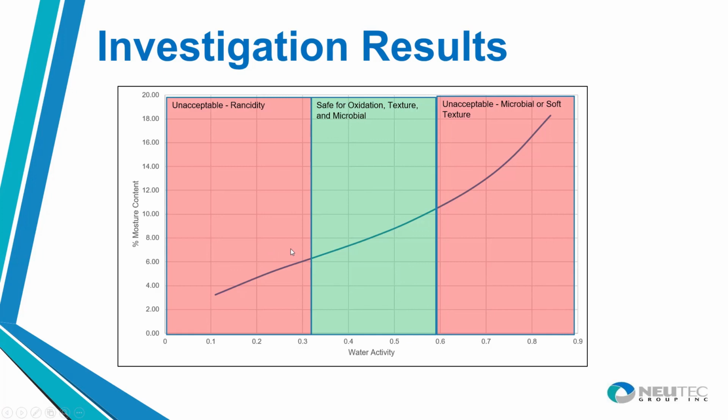But again, it was because they had increased water activity and also, of course, the moisture content, according to the isotherm curve you can see here. We recommended a specification even higher that sits in the midpoint of this range of acceptability at about 0.45 water activity. The added advantage is that's at a higher moisture content, which means less processing to get to lower water activities, and having more water, your cheapest ingredient in the product, that's sold on a weight basis. So this not only makes the product more stable, it also optimizes production and increases profitability for the company. So all around, it's a great solution.